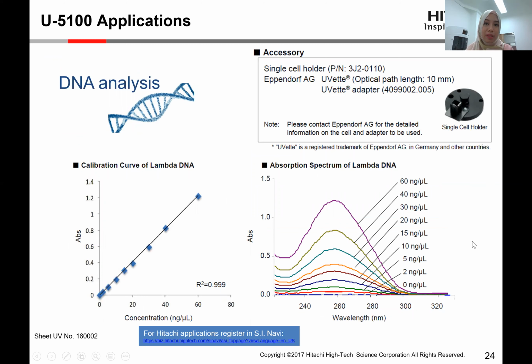Of course, you need to build up your calibration curve first with your standards. So here you get a lot of standards, okay? And then you build up the concentration, and from there, using the function of DNA, you can also test the concentration of your DNA sample.